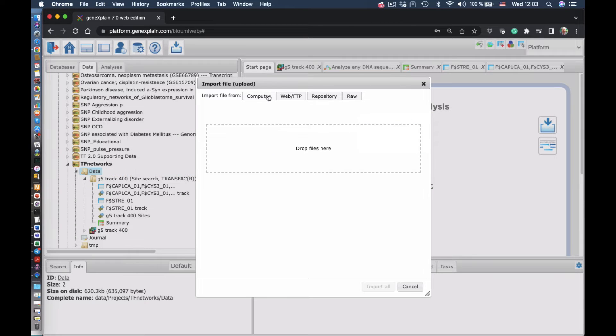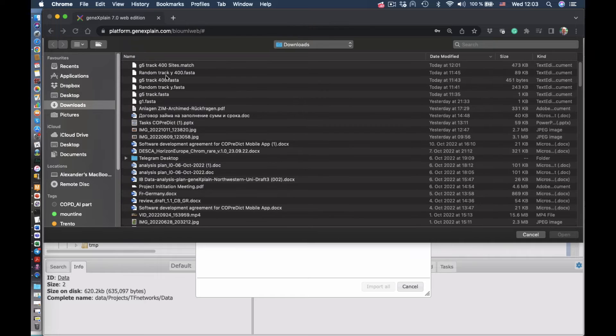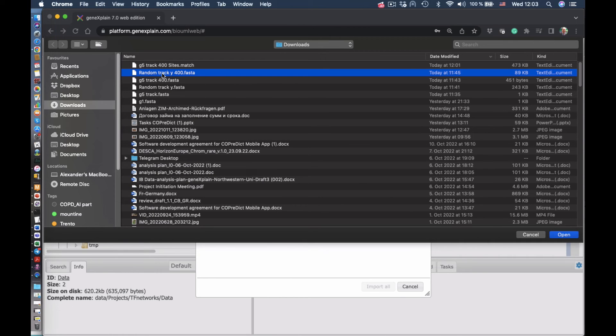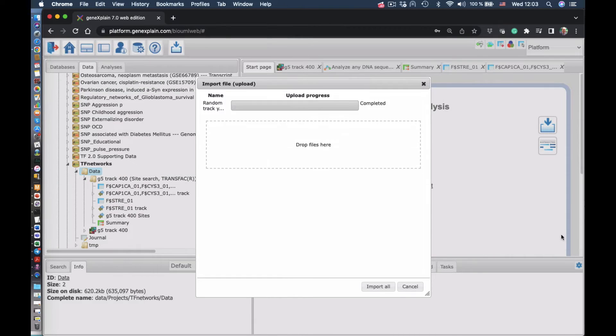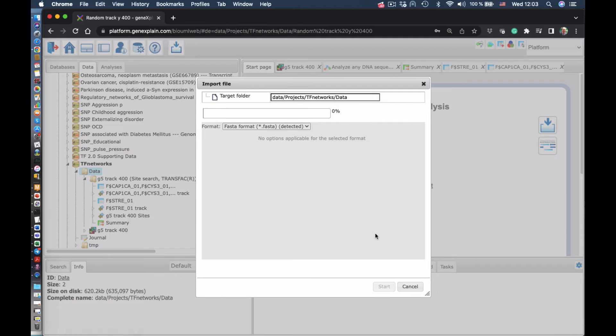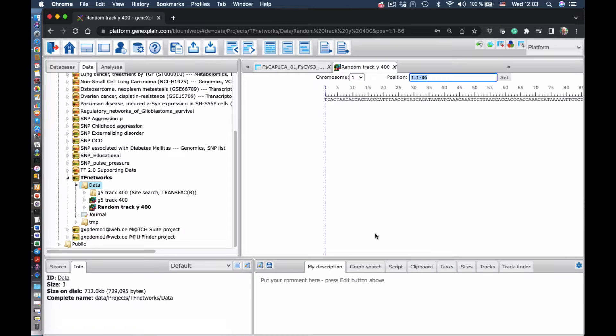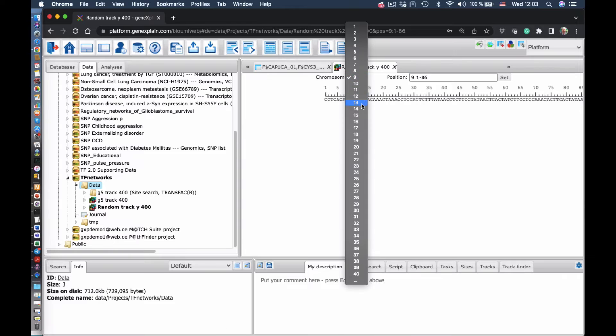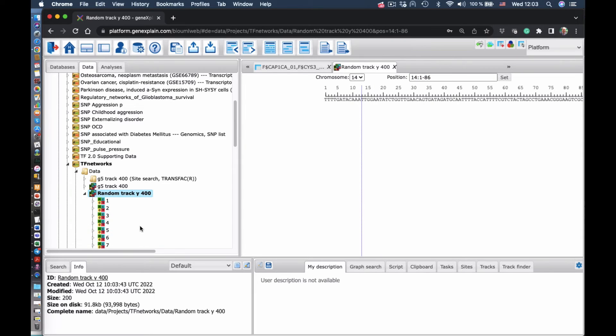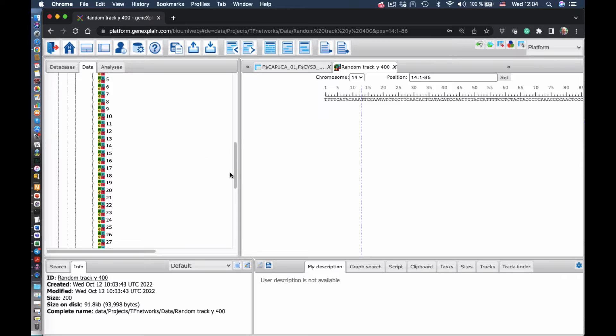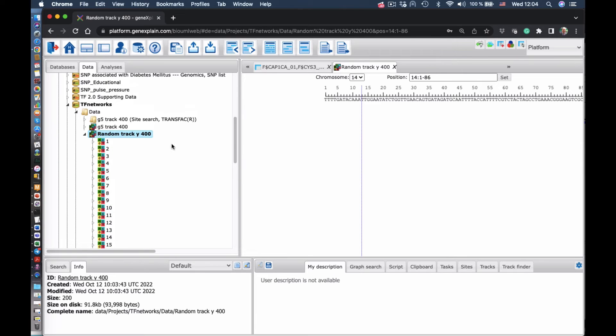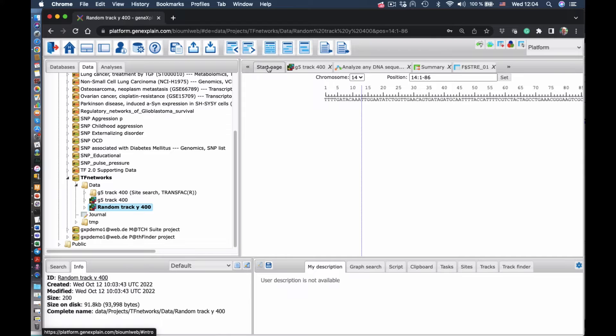Now we have to load them into the platform. So we select this file with random sequences in FASTA format. We import them into the platform. Now you see all of them here. We have basically 200 sequences as a background, each sequence of the same length as a foreground sequence.